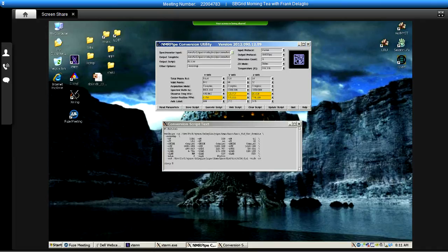And although maybe you would say I'm a little biased about this, data from a Bruker spectrometer needs a lot more special attention than data from an Agilent spectrometer currently does. But we'll see more about that. So in practice, what we do most keenly is establish the chemical shift calibration information. And I'm going to talk about this in a little detail because it's particularly important.